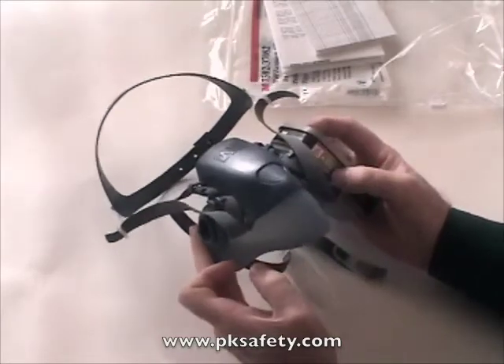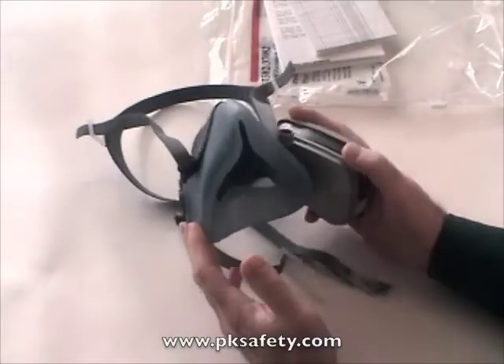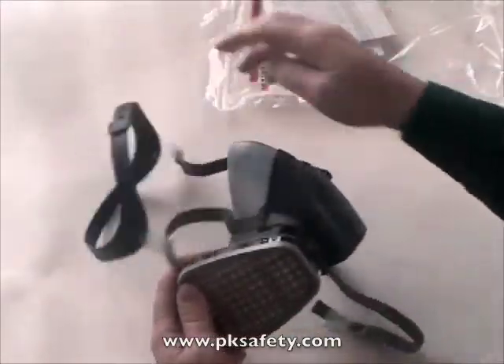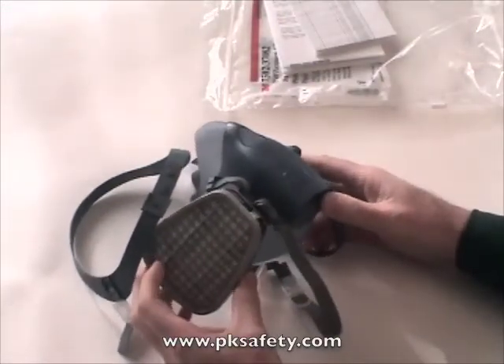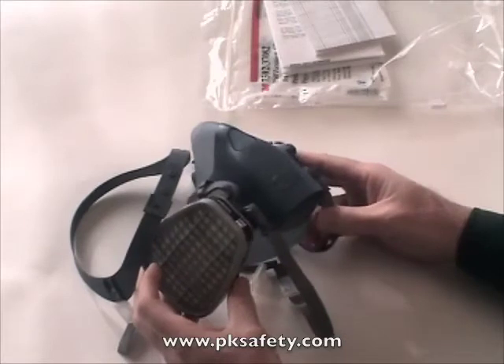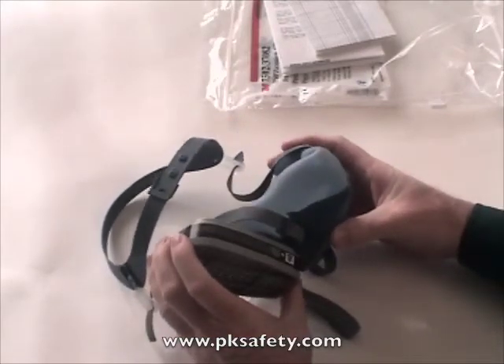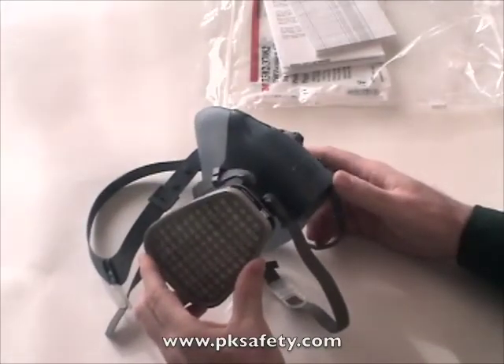The mask comes apart pretty easily, so you can hand wash it with soap and water. Very good, very high quality. It costs a little bit more than the 3M 6000, which we sell more of, but it's around $22 or so. If you're into that, this is definitely the high quality product.